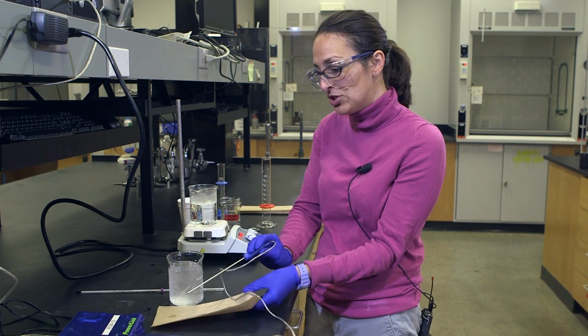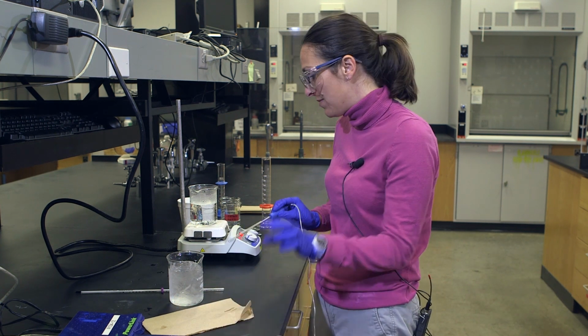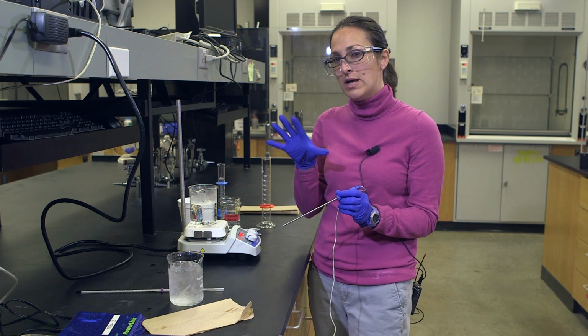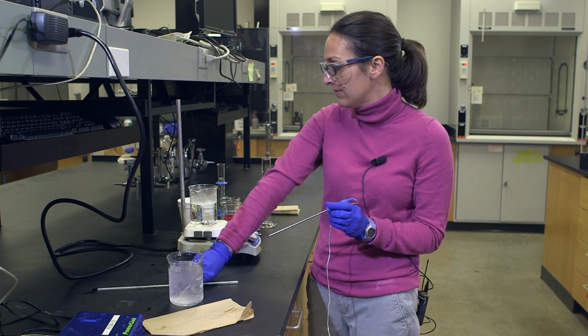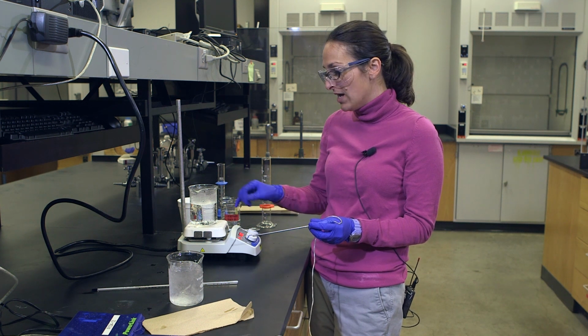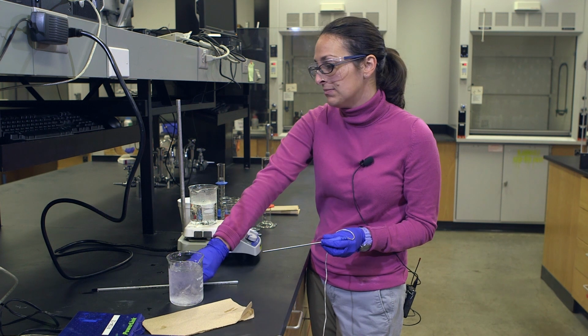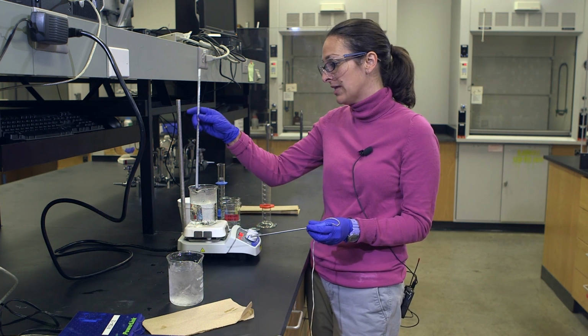For my higher temperature limit, I'm going to use my thermometer and I'm going to have a hot water bath. I don't want it boiling, but pretty close to boiling. And these bubbles are not indicative of boiling water. These are just some dissolved gases that are effervescing. You'll be able to tell if it's boiling.